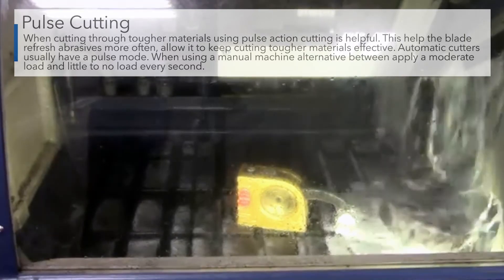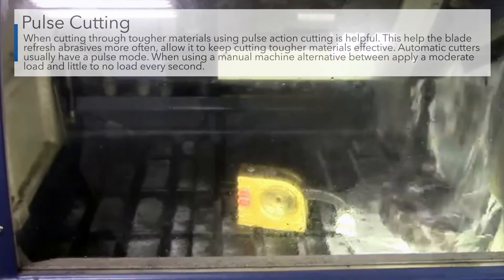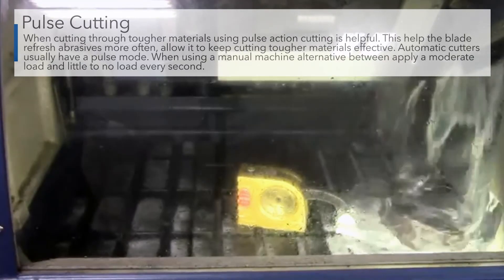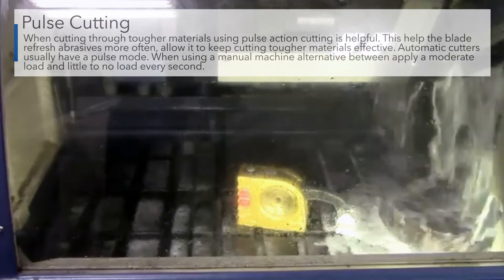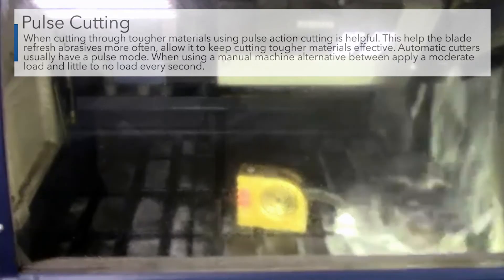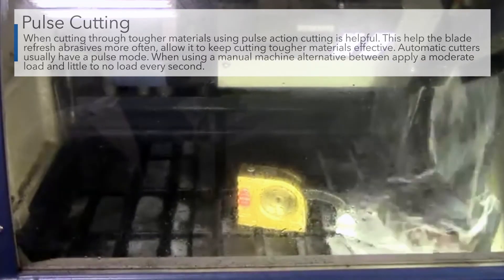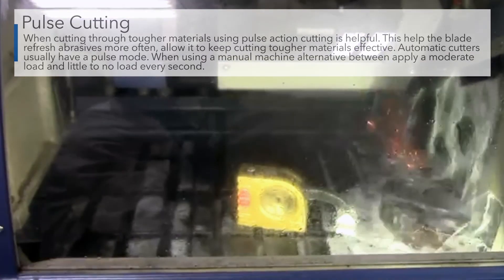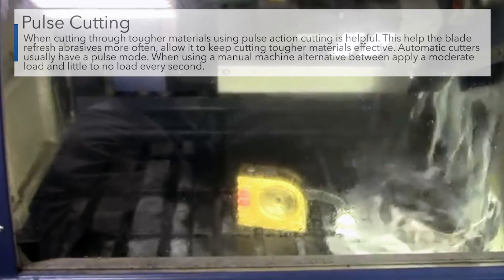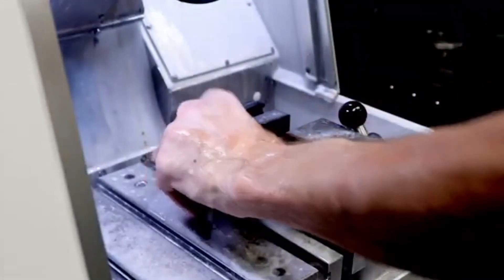Information on blade recommendations can be found on Buehler's website. When cutting through tougher materials, using pulse-action cutting is helpful. This helps the blade refresh abrasive more often and allows it to cut through tougher materials more effectively. Automatic cutters usually have a pulse mode. When using a manual machine, alternate between applying moderate load to little or no load every second.